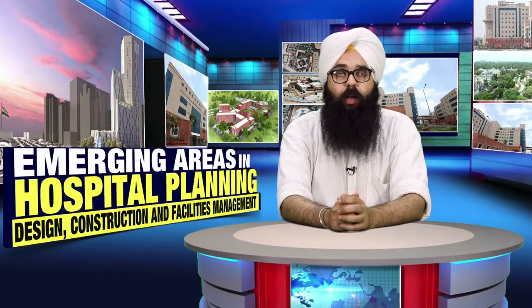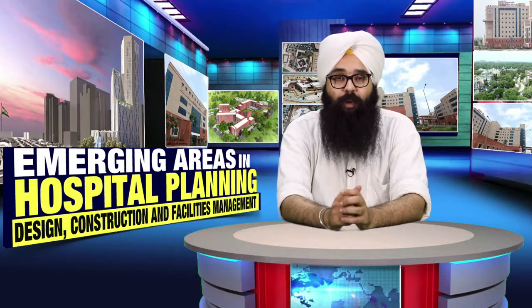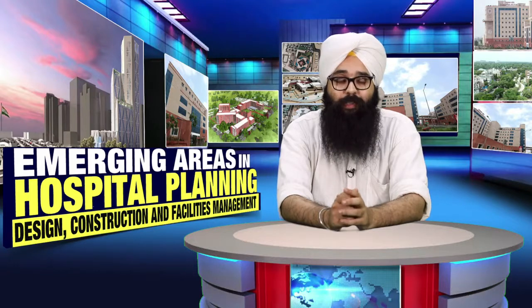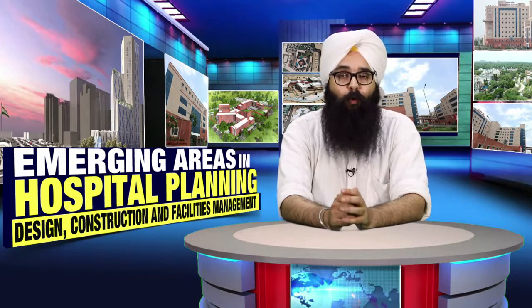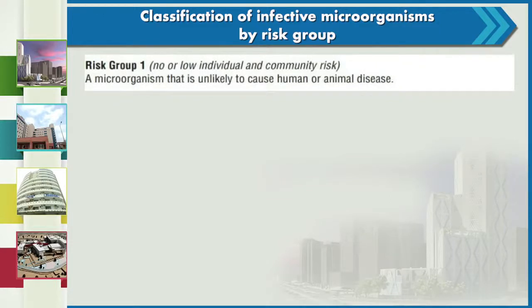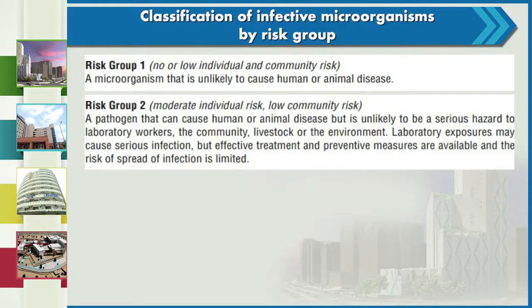In a laboratory there are substances which can pose a threat to humans because they are present in high concentration. We classify them according to the risk they pose. Risk has been classified into four levels. Risk group 1 means the microorganism is unlikely to cause any disease. In risk group 2, the pathogen can cause human or animal disease but is unlikely to be a serious hazard; effective treatment and preventive measures are available and the risk of spread is limited.